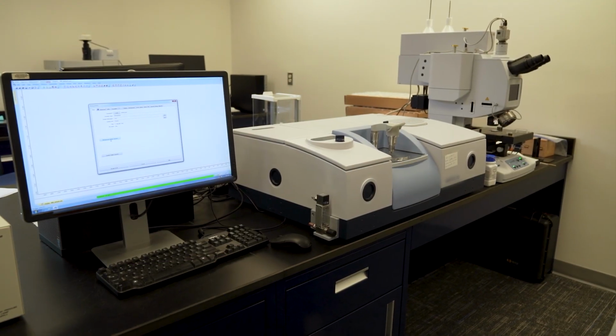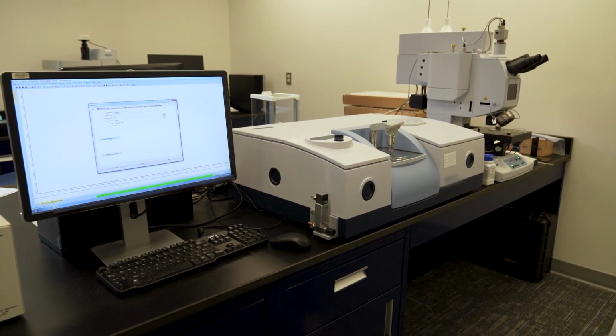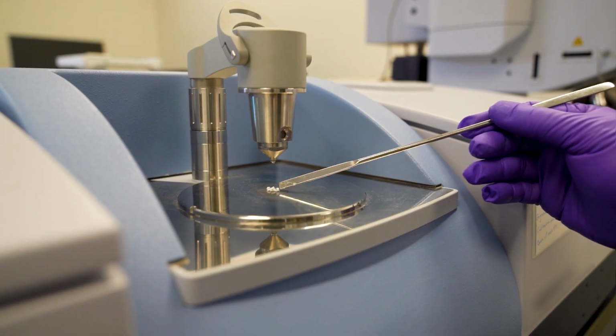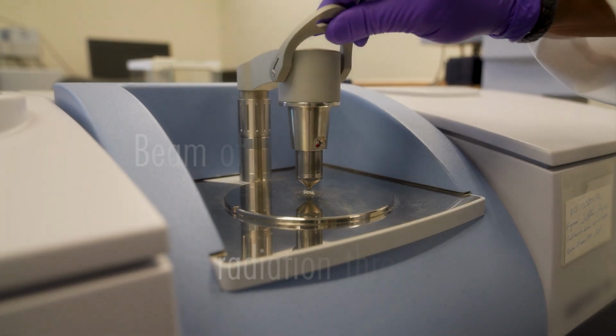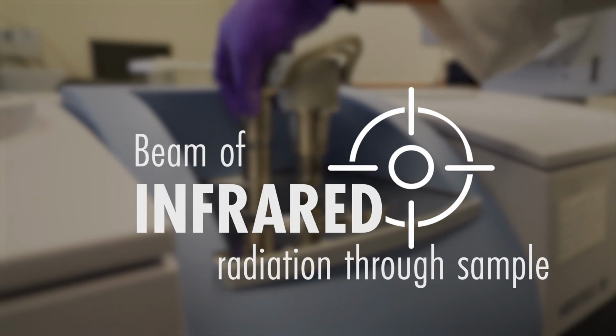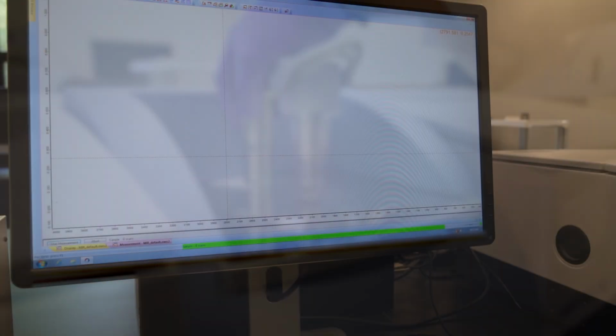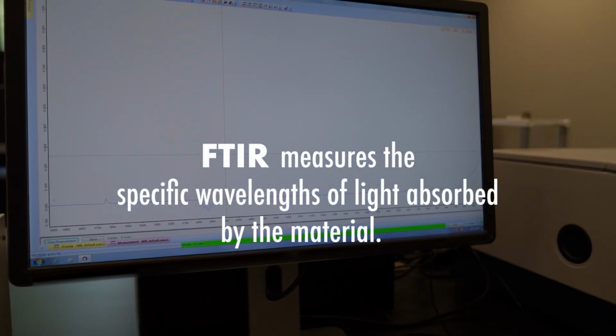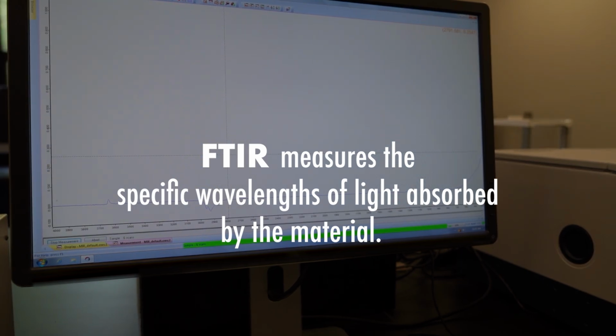To use the FTIR spectrometer, the technician first carefully places the sample onto the device's sample platform. The spectrometer then directs a beam of infrared radiation through the sample. As the infrared light interacts with the sample, the device measures the specific wavelengths of light absorbed by the material.